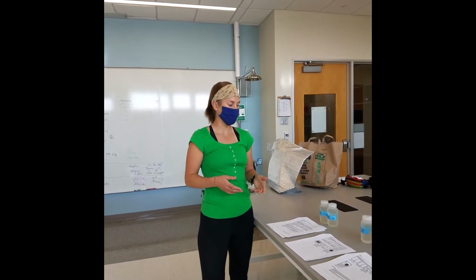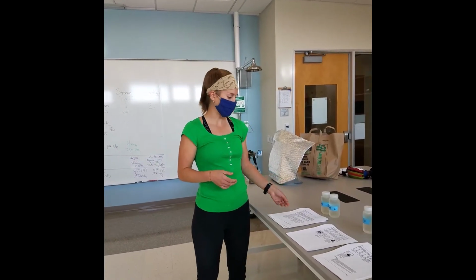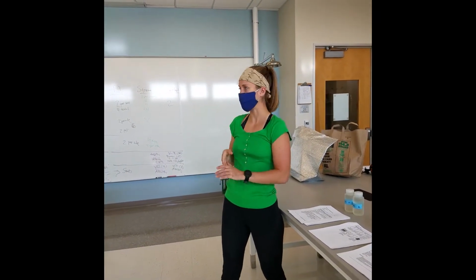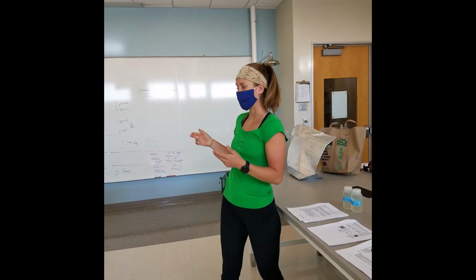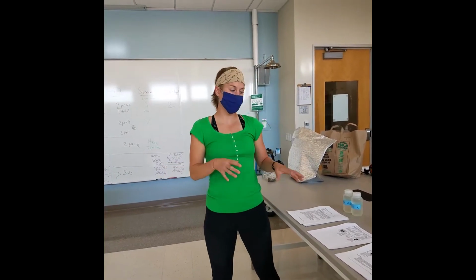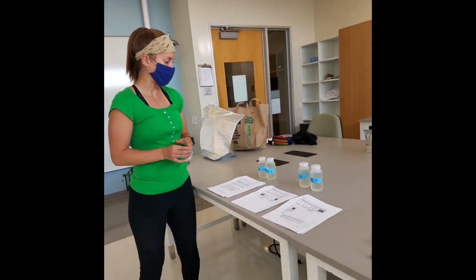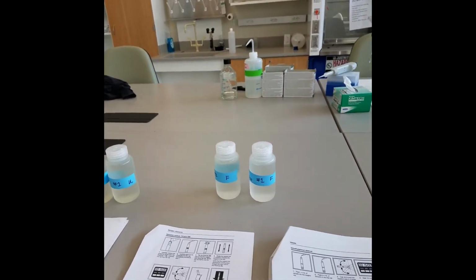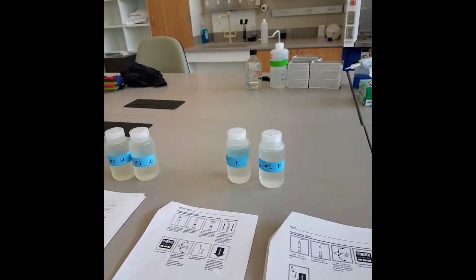All right, so the first lab procedures that we're going to do are with our filtered and unfiltered water samples that we have from both the lake, so from the pond area at Potomac Science Center, and then the freshwater tidal. But we're just looking at our samples today that we took from the freshwater tidal river. And that was the first time that we were out in the field a few weeks ago.